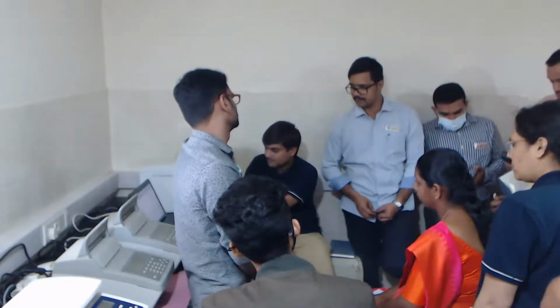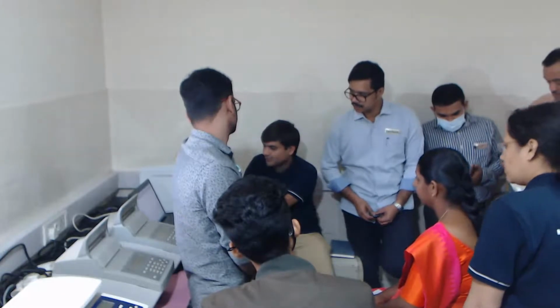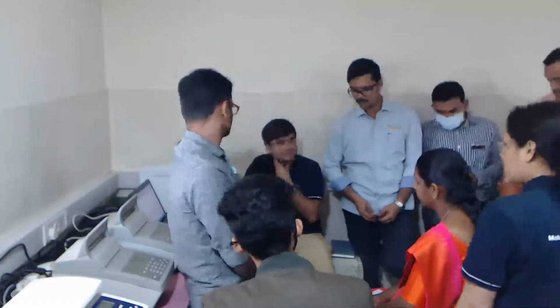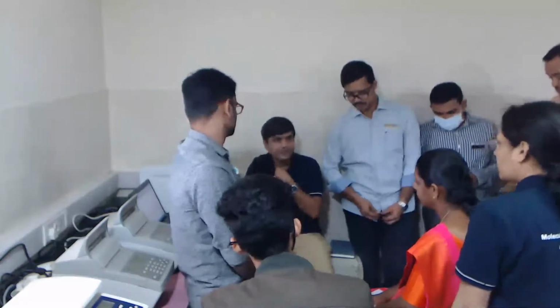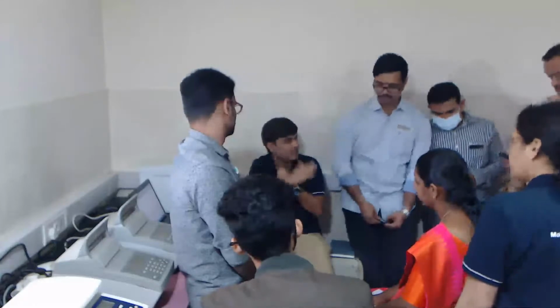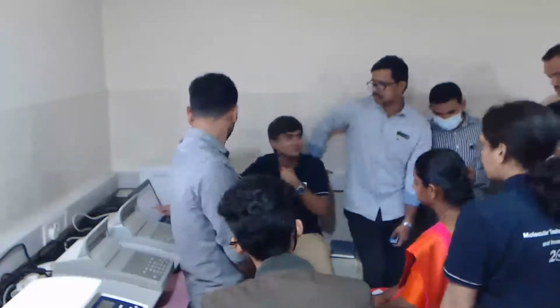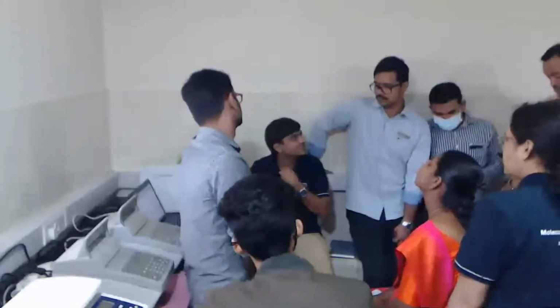Integrity of the fragments, we don't need to care. The bioanalyzer only gives you the pattern of fragments: how much length, which fragments, and what fragments of what length are in what proportion. These fragments of this size are more in number compared to fragments of this size.